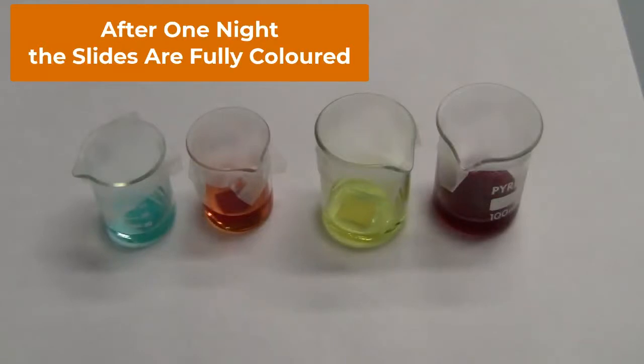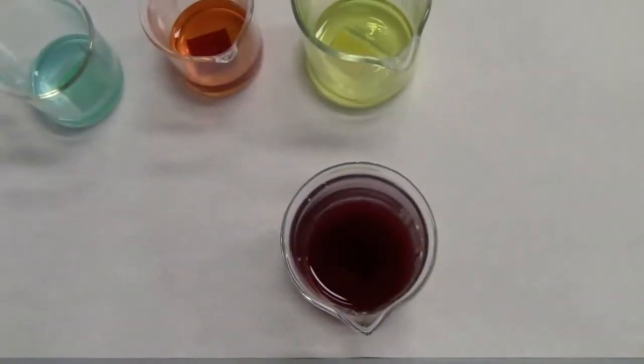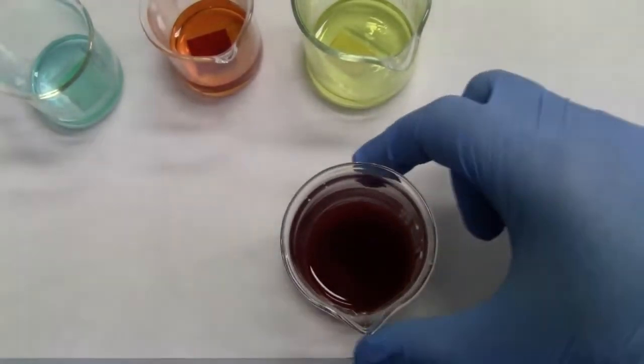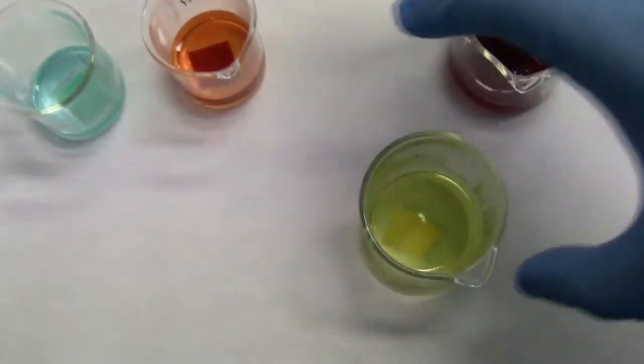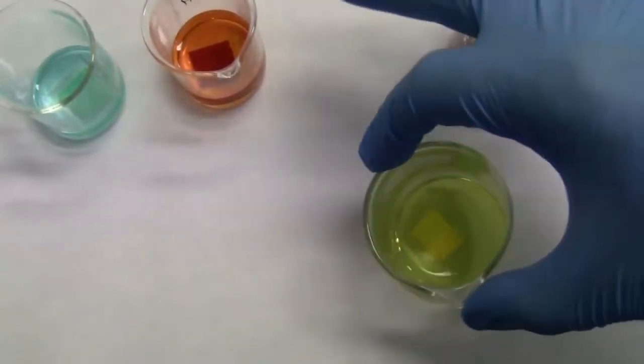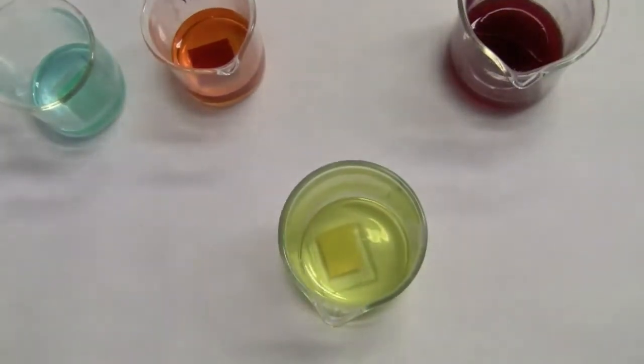After one night in the dark, we can see our glasses and we can see now also better from the top. They resulted to be colored consistently in different colors that obviously are depending on the kind of dye we have used.